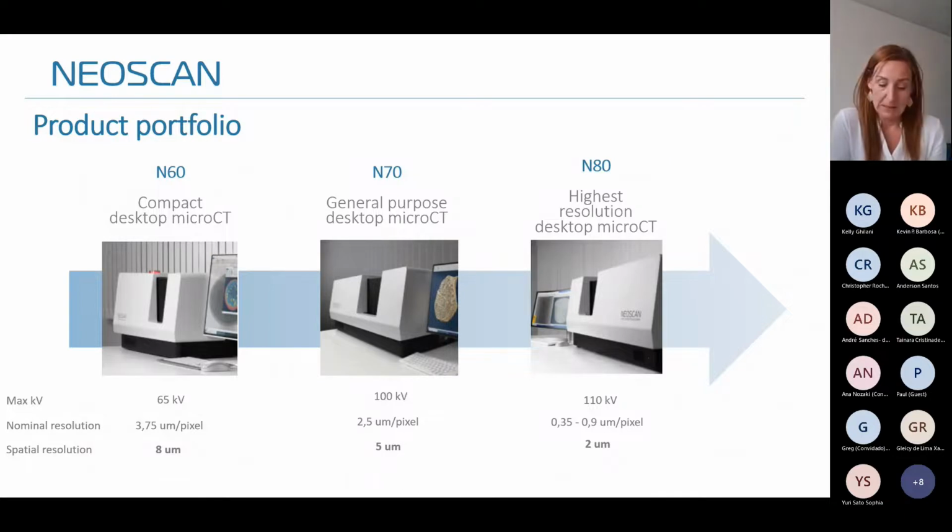Now, it's these specifications or the performance of these instruments that I would like to talk about. And these specs that you see here all relate to the questions which you probably had when hearing about MicroCT. So let me explain.